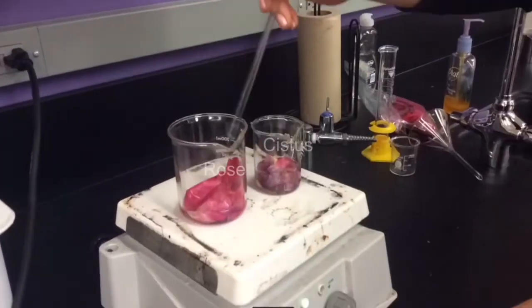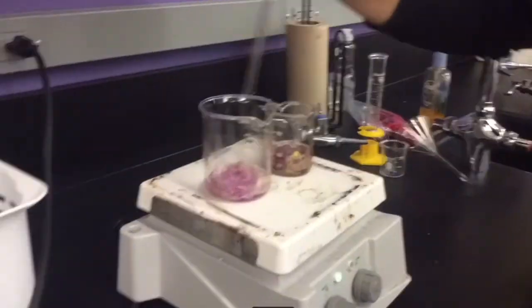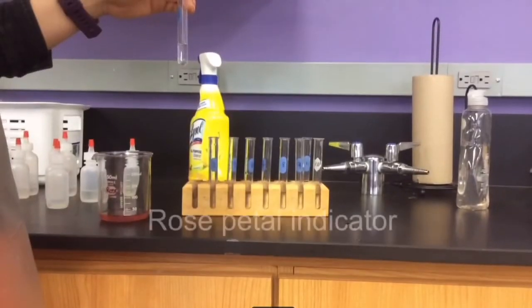Put 12 petals of each of the flowers in the ethanol and heat on hot plate, mixing occasionally. When the petals lose their color around seven minutes, remove the beaker and take out the petals.